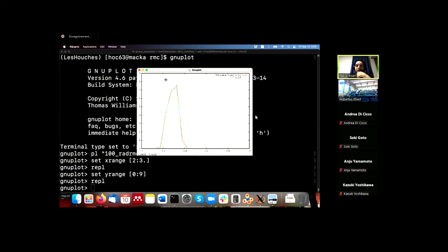And of course, if you increase the number of atoms, you can also use a finer mesh for the distances, so that you can have a more accurate description of the peaks.